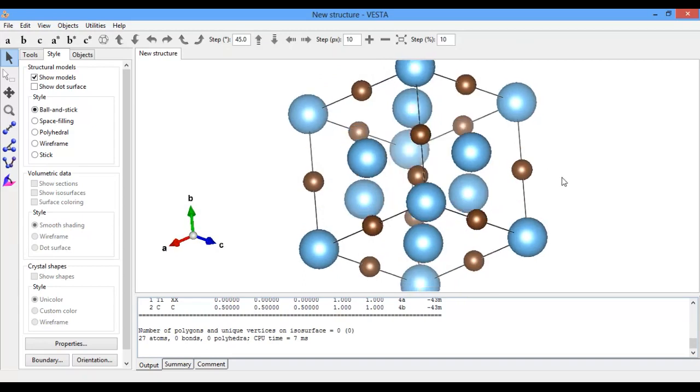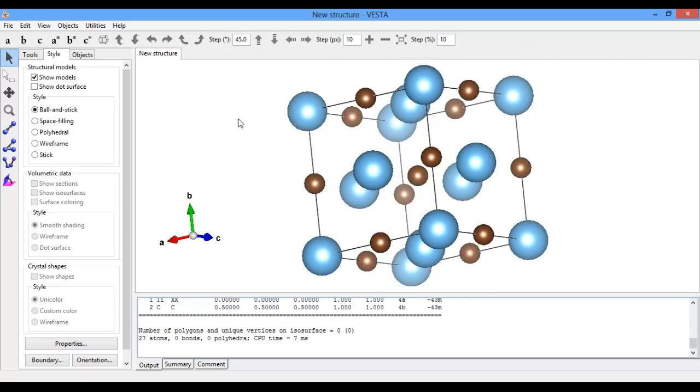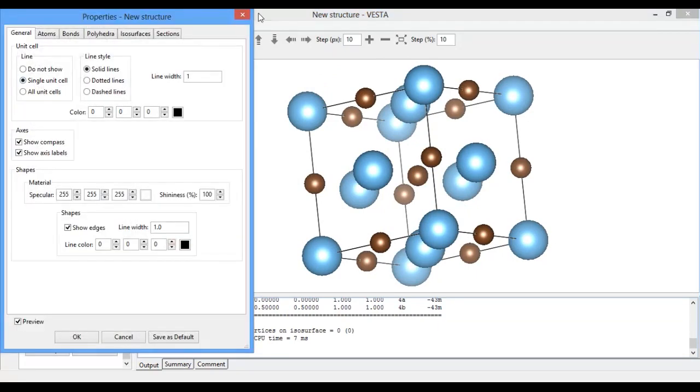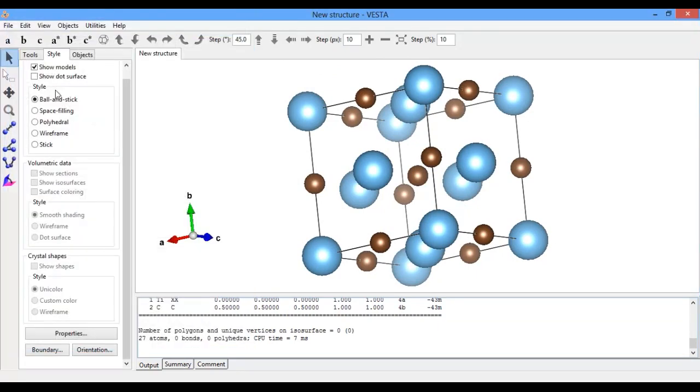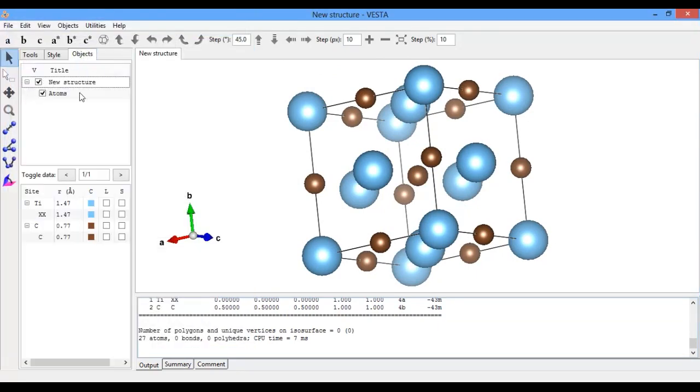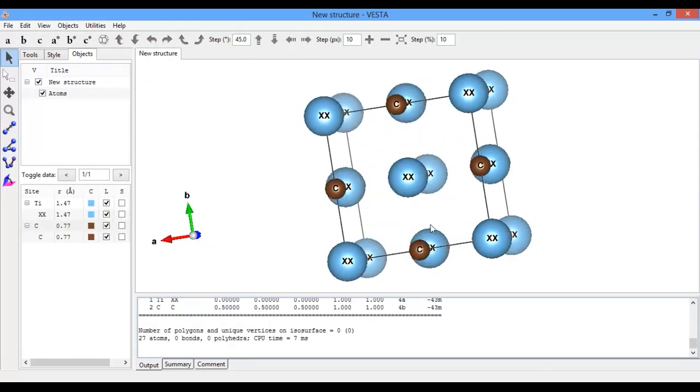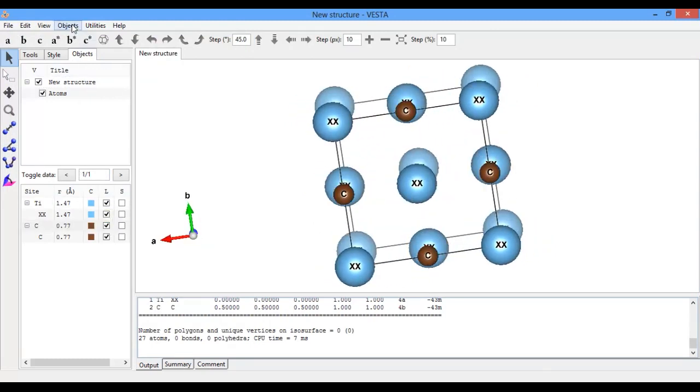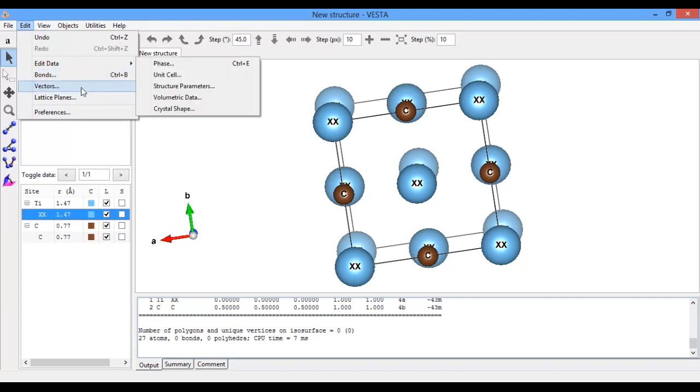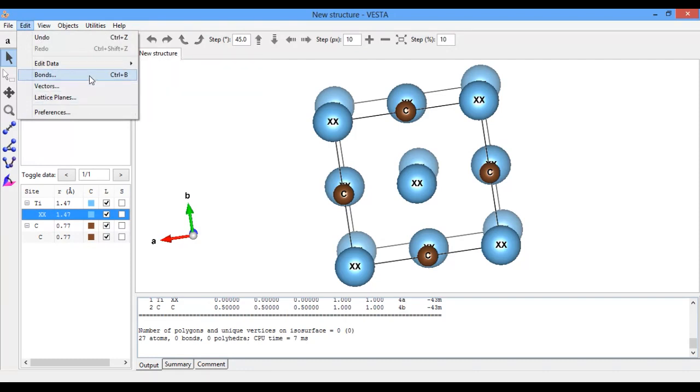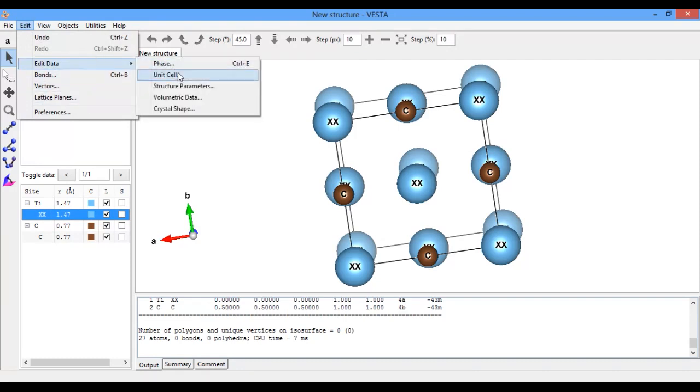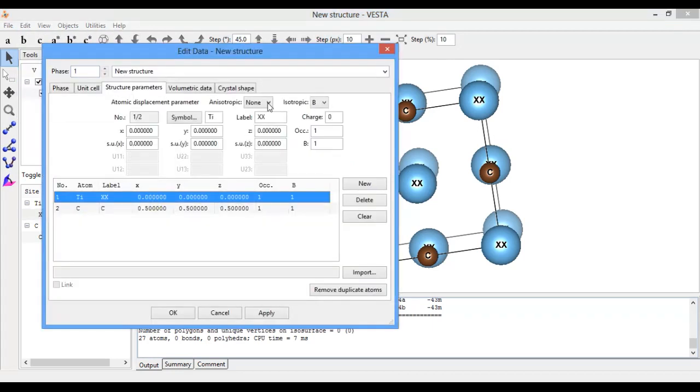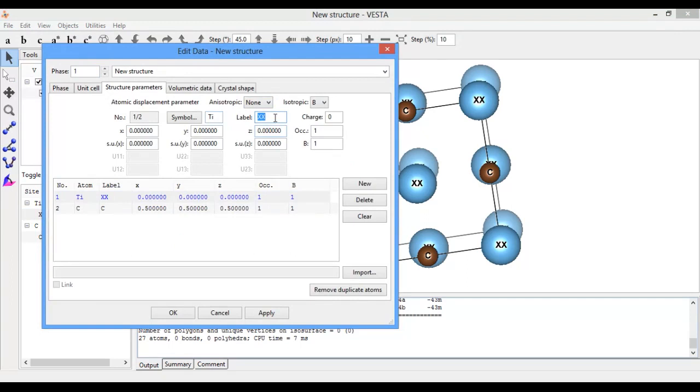You can see the crystal structure of titanium carbide. Go to Property, Object, Show Labels. I will label it as Edit Structure Parameter. Here, label this as Ti.